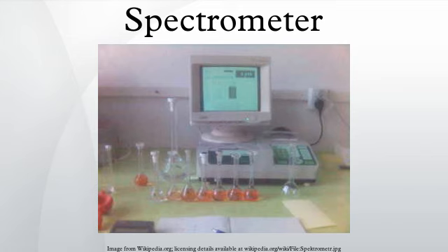When a material is heated to incandescence, it emits light that is characteristic of the atomic makeup of the material. Particular light frequencies give rise to sharply defined bands on the scale which can be thought of as fingerprints. For example, the element sodium has a very characteristic double yellow band known as the sodium D lines at 588.9950 and 589.5924 nanometers, the color of which will be familiar to anyone who has seen a low-pressure sodium vapor lamp.